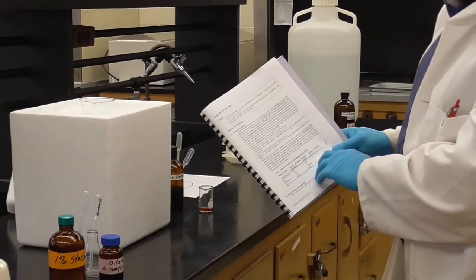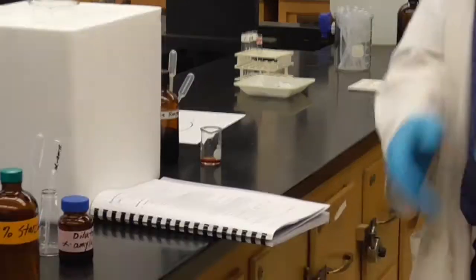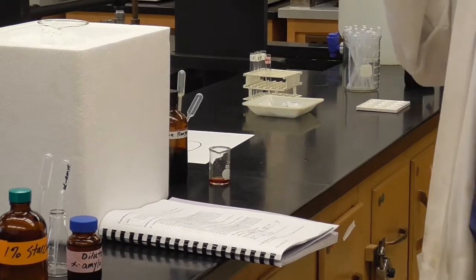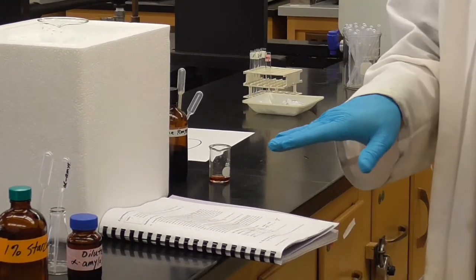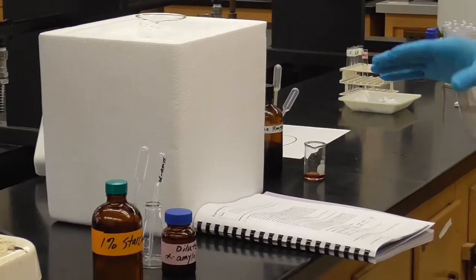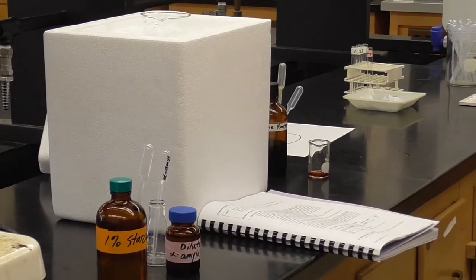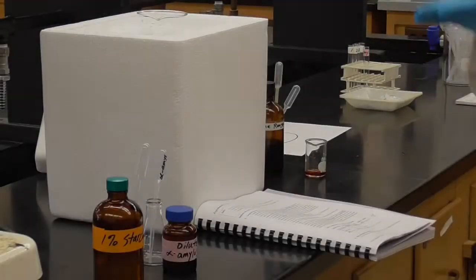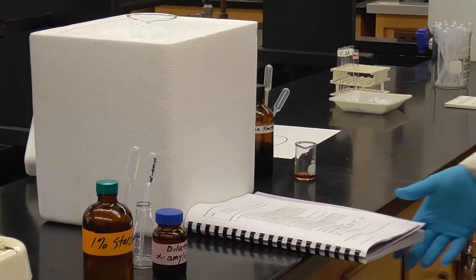And finally, at the very lowest one here, a dark blue-black color, that would indicate no activity of the enzyme. All that starch is still there, it wasn't broken down, that enzyme was not working, okay? Or it wasn't present or something like that. And so we'll see different temperatures, different pHs, how does it affect that enzyme? So got it? We're going from a dark blue to blue, light brown, and gold, meaning 0, 1, 2, and 3 on the level of enzyme activity.